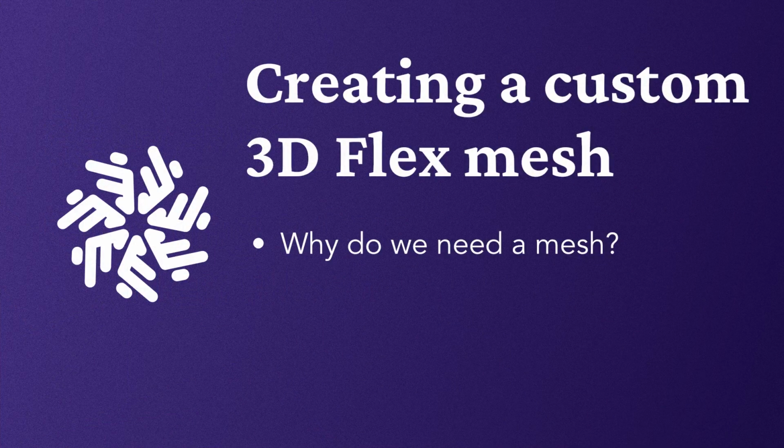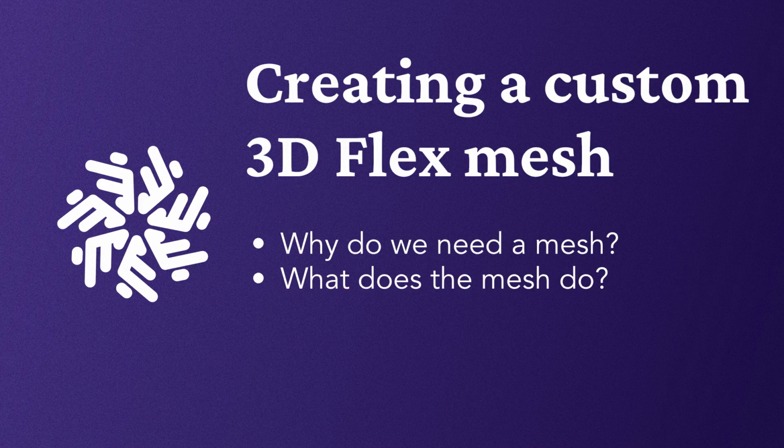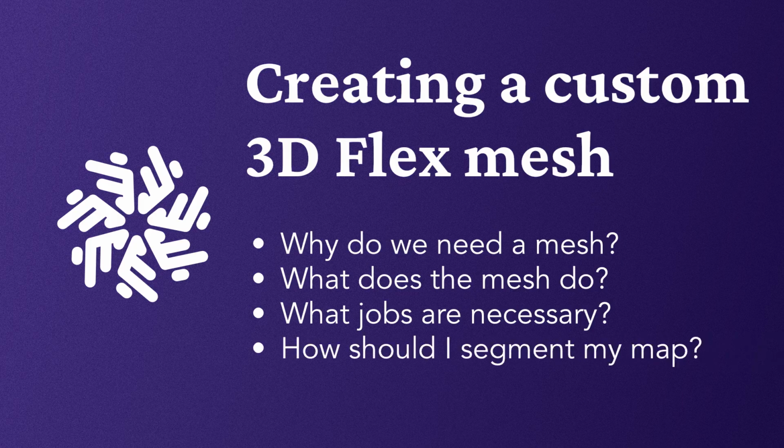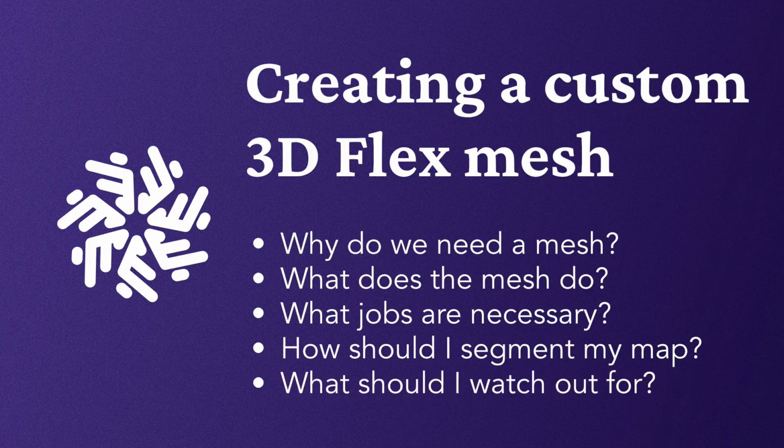I'm going to talk about what that mesh does. Then I'll discuss what you need to do to prepare to create one of these meshes. I'll walk step by step through the process of performing a segmentation as well as using that segmentation to create a mesh. And then I'll talk about some potential pitfalls and things to watch out for when you're fine-tuning your mesh, and settings you might want to play with to get the best possible result for your 3D flexible refinement. So without further ado, let's go ahead and get started.